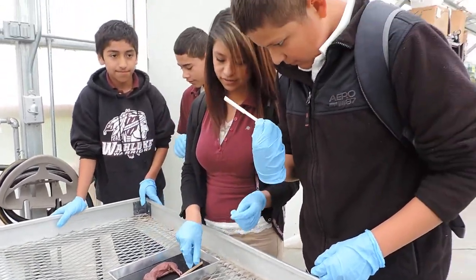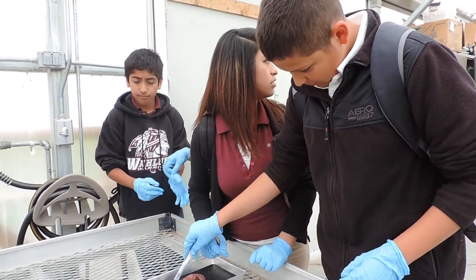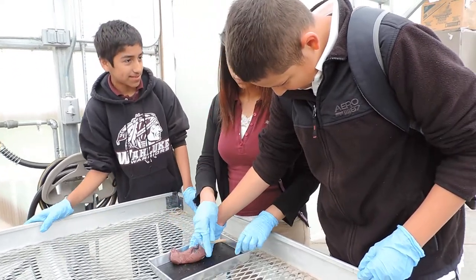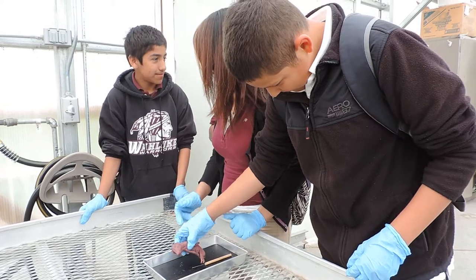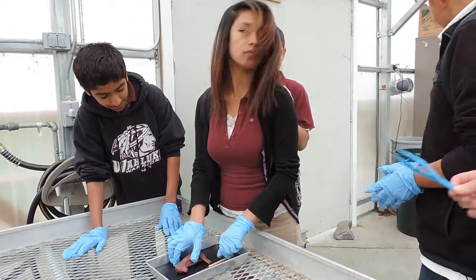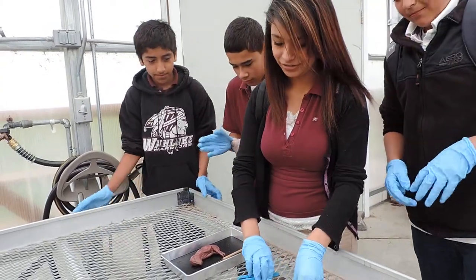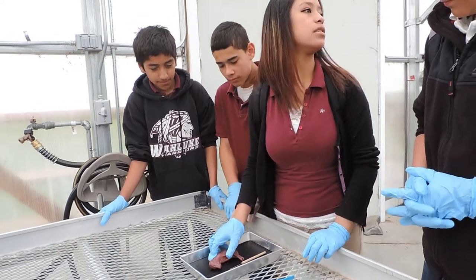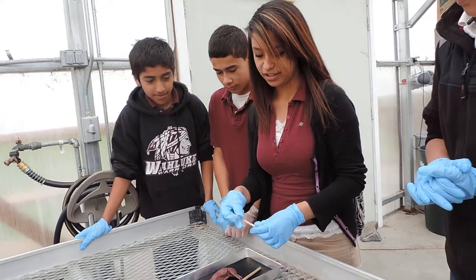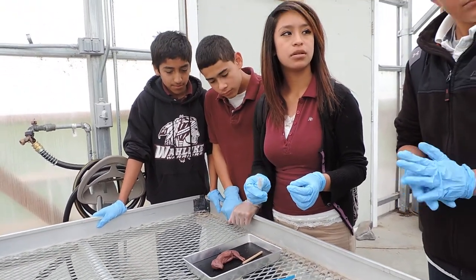This for stealth, right? Where's the knife? Scissors, forceps. Sure. This for skull, right? You could. Now don't cut the skull open on this pig because you have to get into the inside.